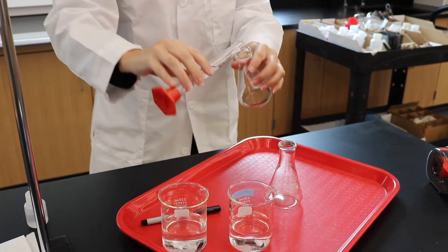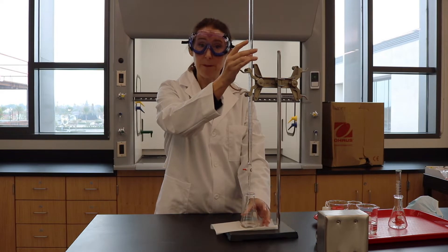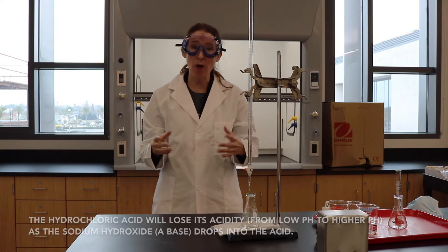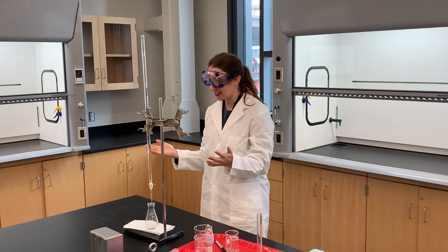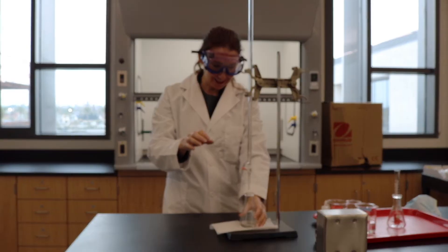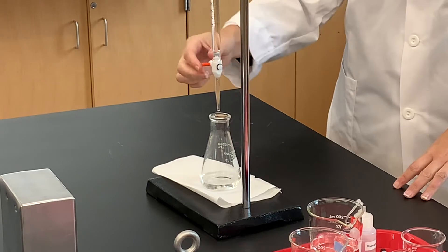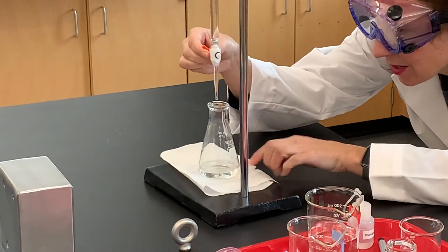Right now I have a base — sodium hydroxide — which is colorless, and I have my acid and my indicator, which are also colorless. When I add the same number of moles of my base as my acid, this is going to turn pink, and that indicates that now I have a pH neutral solution, which means a pH of 7. We do this in our Chem 219 lab and you get really good at it.